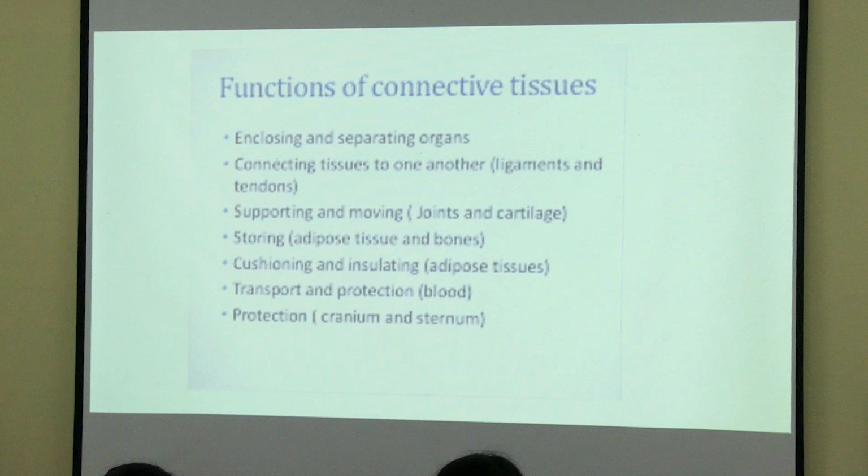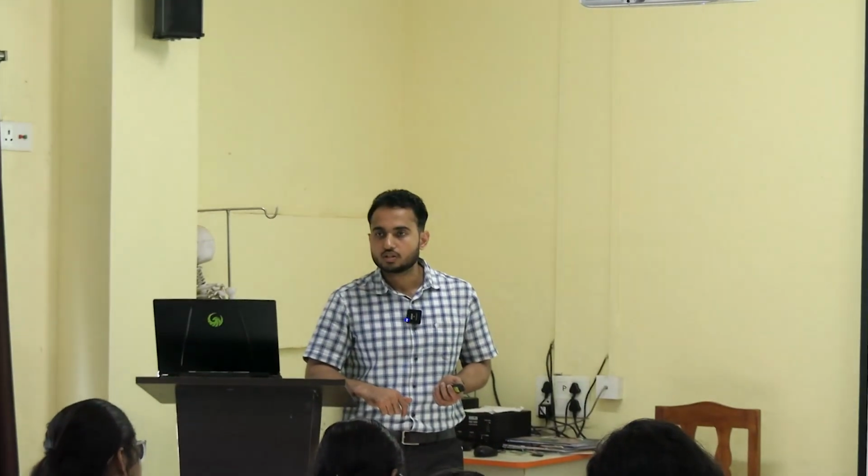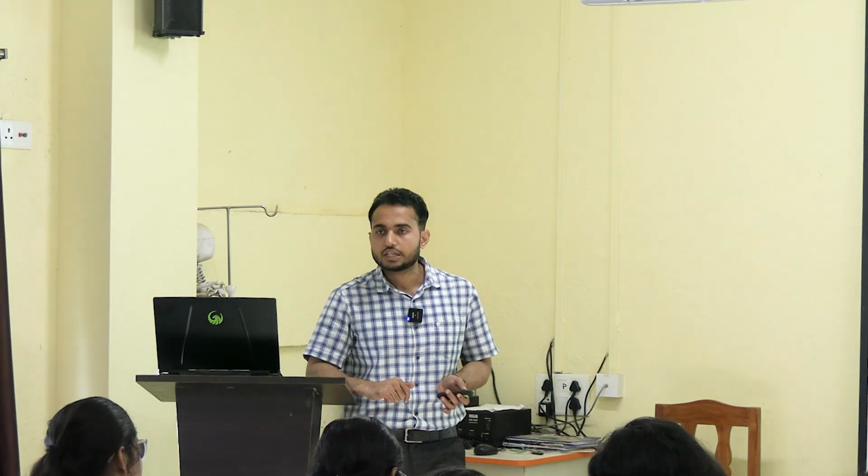So bone is also a type of connective tissue. I hope you know that. Specialized connective tissue, but it is a connective tissue, which is protecting. For example, sternum, very important. Why is it important? Any idea?